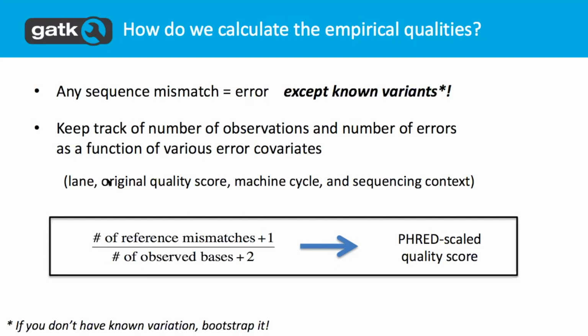If you're counting how much coverage you have and you're doing it in a way that is aware of the usable quality, you might end up with less coverage than you originally had if you're looking at usable coverage. Does that answer your question? Okay, great.